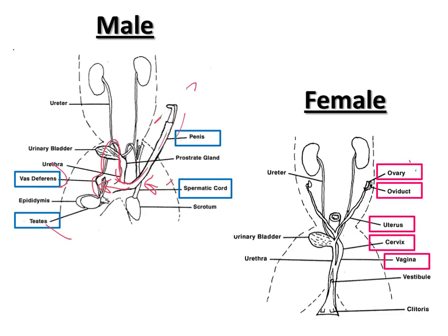Also, you can see on this page a pretty good picture of the urinary system of the actual mink, and these are the pictures that appear in your mink handbook. For that urinary system, notice again that you've got your kidneys up here on the body wall. The ureters come down, and this is a weird looking picture here, but when you have your mink open, you'll notice that this really is what the urinary bladder looks like.